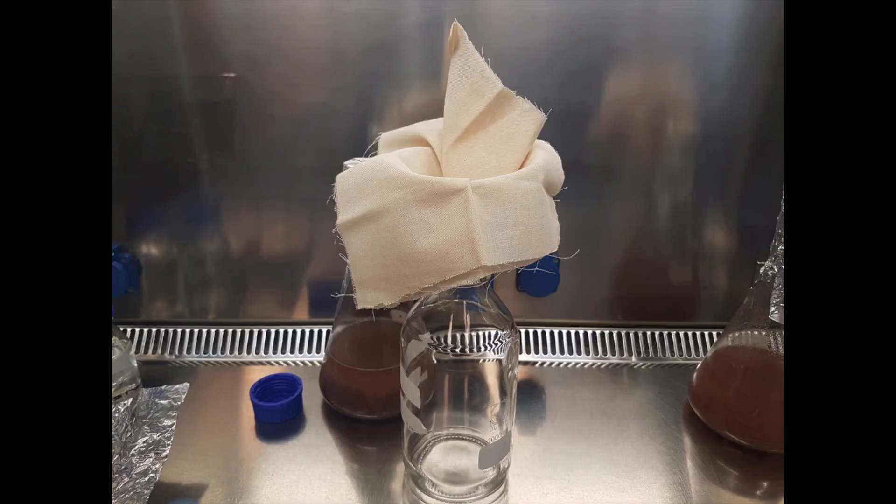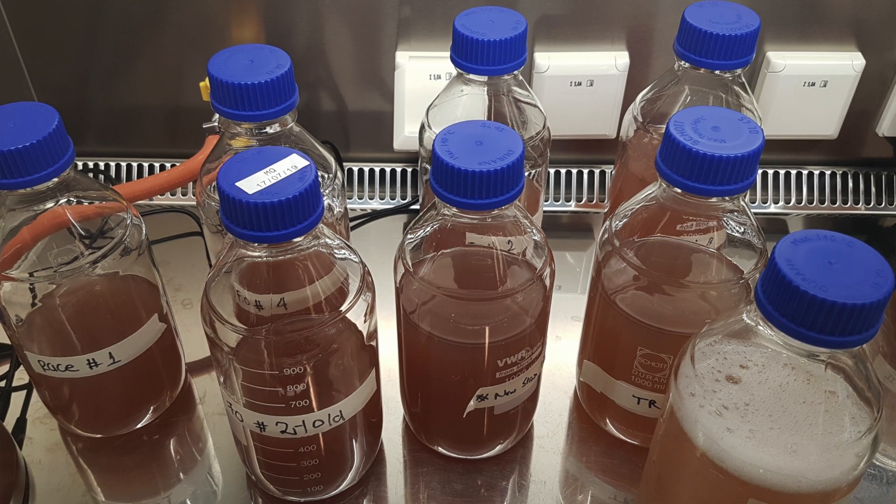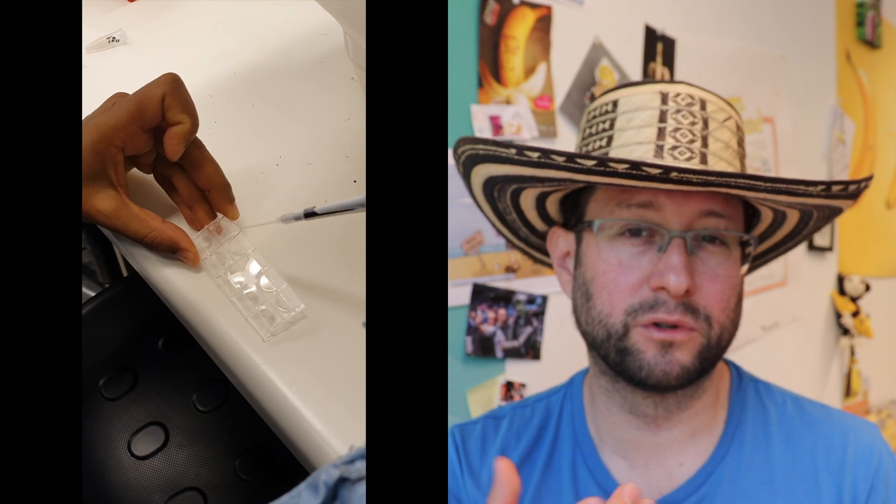Once we are ready, we filter using two layers of cheese cloth and just wait. Once this is done, we do dilutions or take a sample for counting. I really recommend these slides — I will put the information below. They are very simple and disposable, and you only need a few seconds. In this method we use 10 microliters of our material and then observe under the microscope.